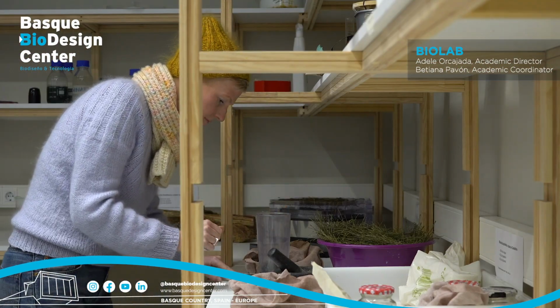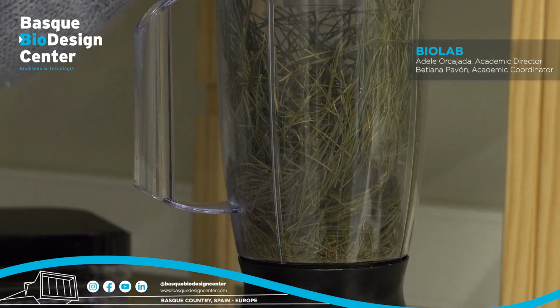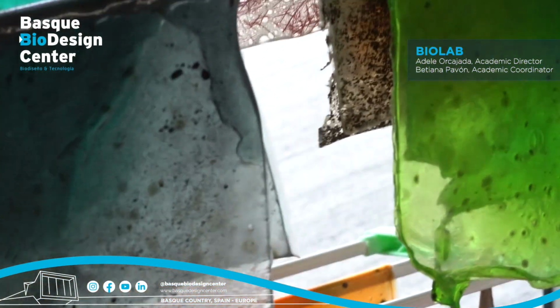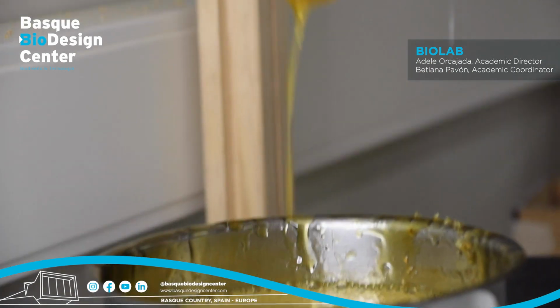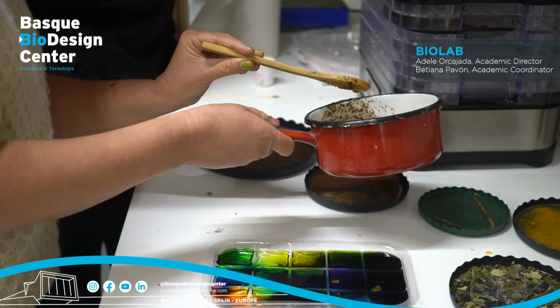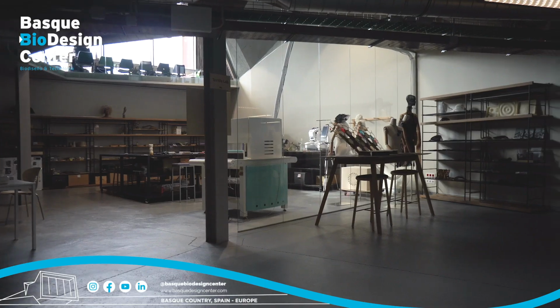We've got different kinds of hot plates where we can do all our cooking. We like to register all the recipes and we share them here on the board. And we also do natural dyes. And then we've got a great corner where we do all our drying in a machine that we've created ourselves so that we can make sure our bioplastics dry without any mold.